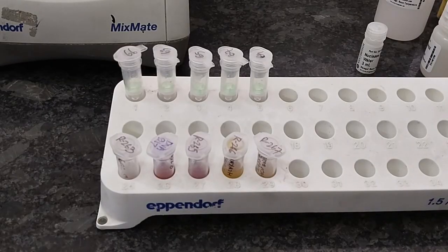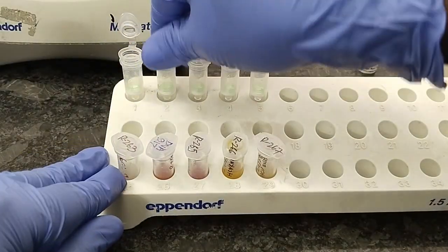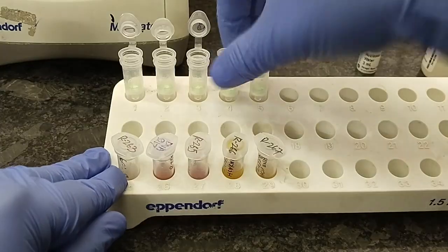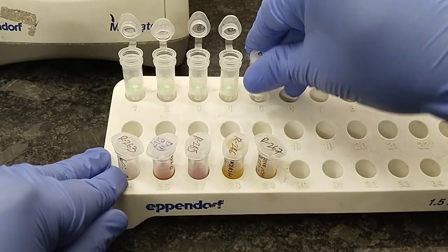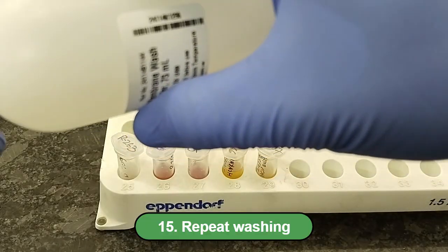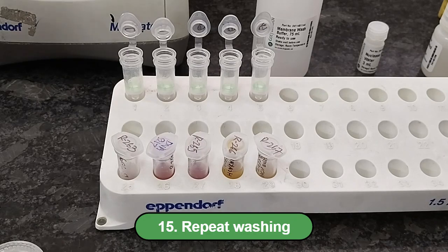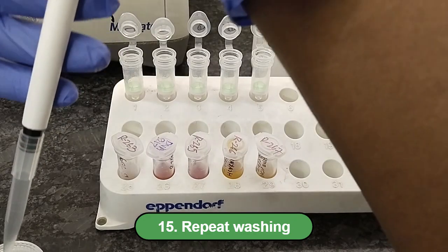Now, as we have seen the first time, add wash buffer for the second time and centrifuge it at 12,000 rpm for 1 minute. The time of centrifugation is optional.